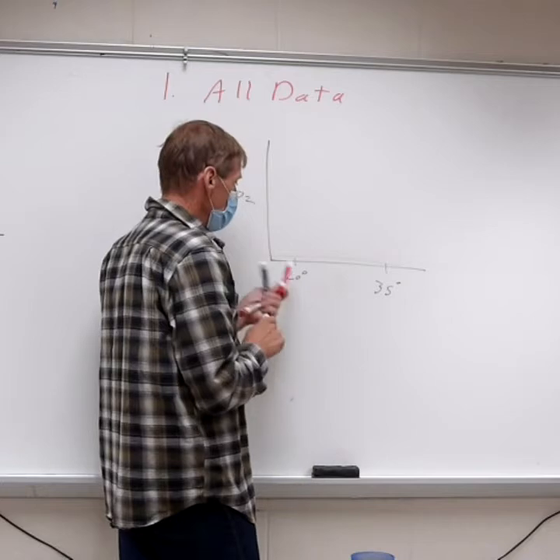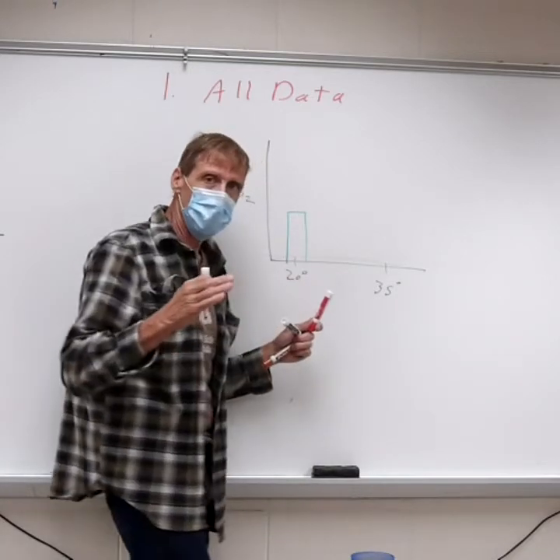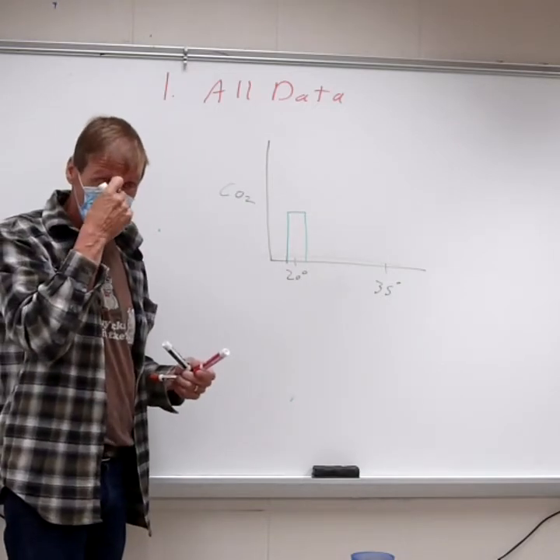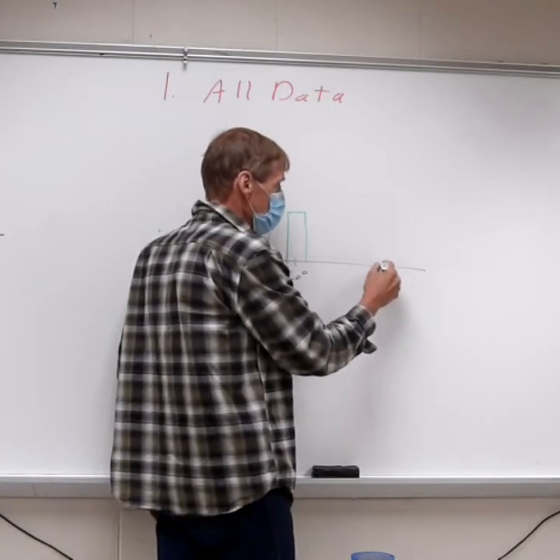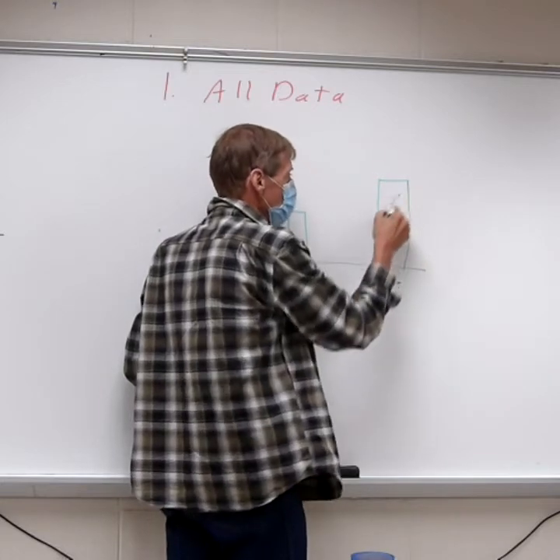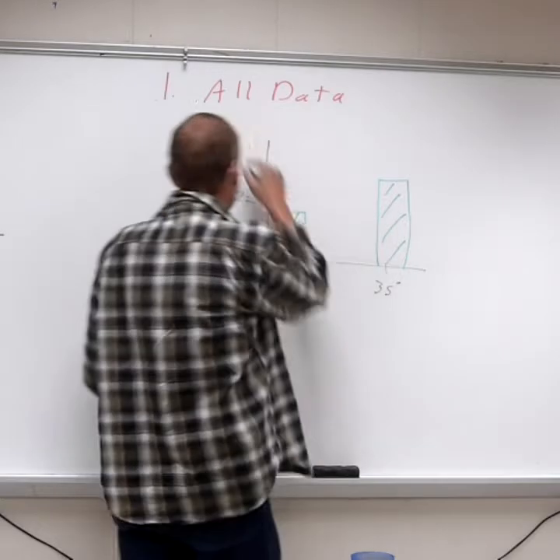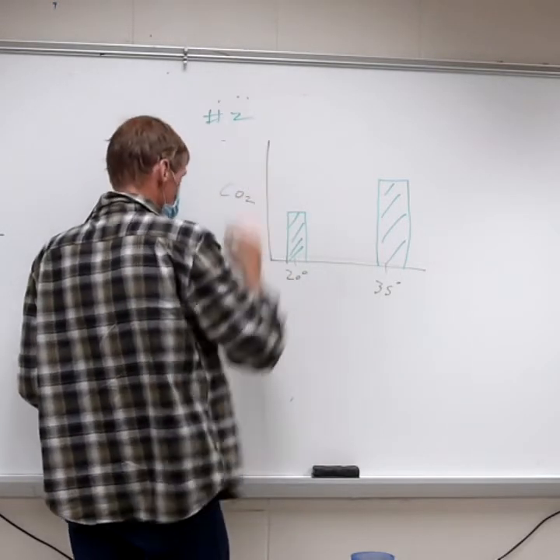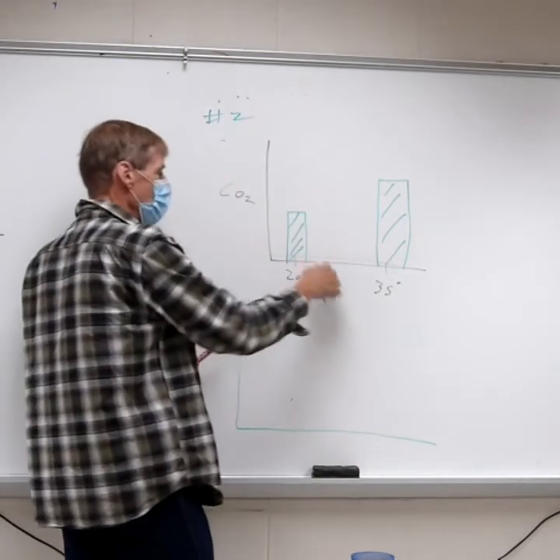Take all 3 balloons at room temp, take the average circumference for the balloons, probably the final circumference, but you know, you could pick dots in between. Again, there's several things you could do. Then you take the 3 groups that were in the incubator, get the average for their circumference. There you go, bar chart. That would be chart number 2. Chart number 3, do something similar, except don't use temperature.